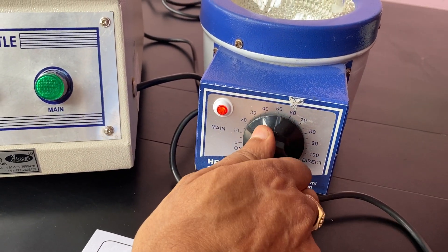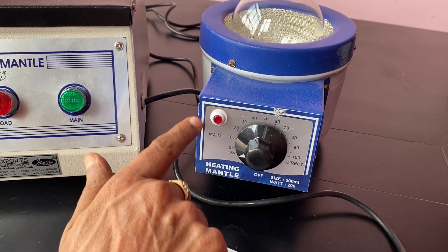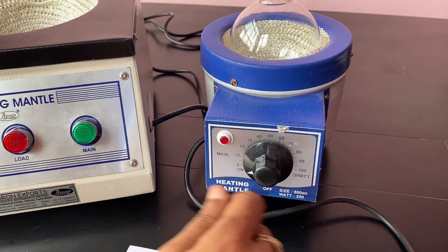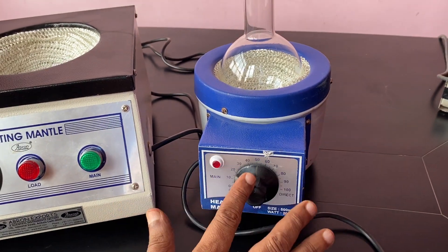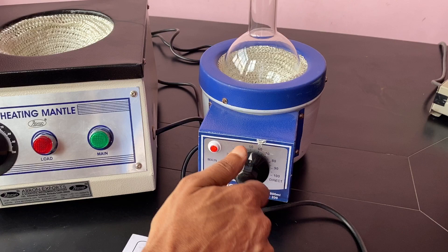When you turn it back, see — it is now switched off. But this is not the off position; at this position it will start on and off. This one is the actual off position. Always remember, this is not a thermostat — it doesn't maintain a set temperature like a thermostat would.